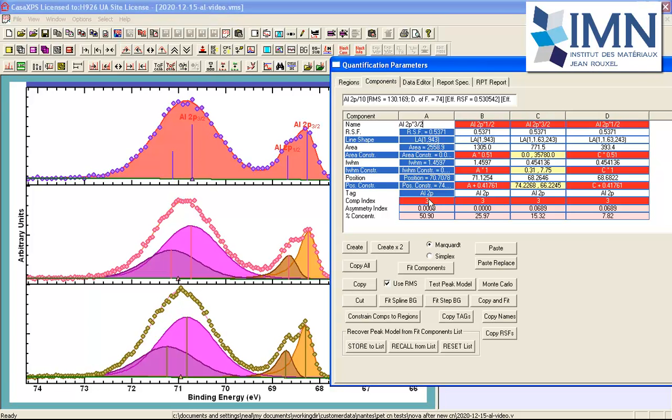And then, because we're dealing with doublet peaks, there is another key string, group equals 2, and this is designed to allow sets of doublet peaks that are arranged sequentially within the components property page to be assigned appropriate component indices. Because I've specified 2, the component index will be left at the current value for 2 components. So this first one and the second one will remain at a value of 3, and then it'll be incremented for the next 2. So when I press return, the doublet nature of these peaks is reinstated, where I've got 3, 3, 4, 4, so we get 2 different colours.